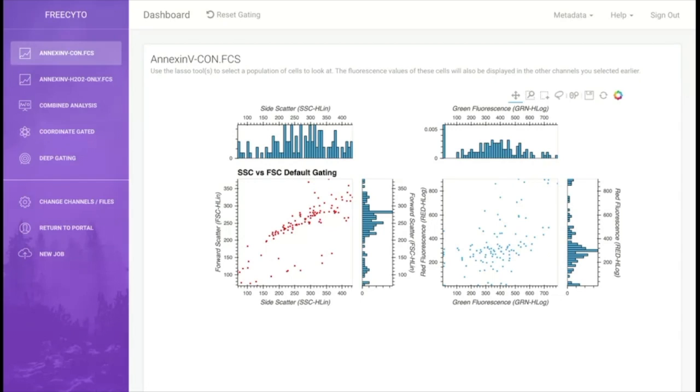In the advanced analysis portion of Freecyto, the quantized dataset, which you can see from the metadata, is 250 points, which is determined based on the size of your original dataset. You can download this quantized dataset in the database dump over here, which downloads it as a SQLite file. All the advanced analysis of Freecyto, the interactive portion, will operate on this reduced dataset.